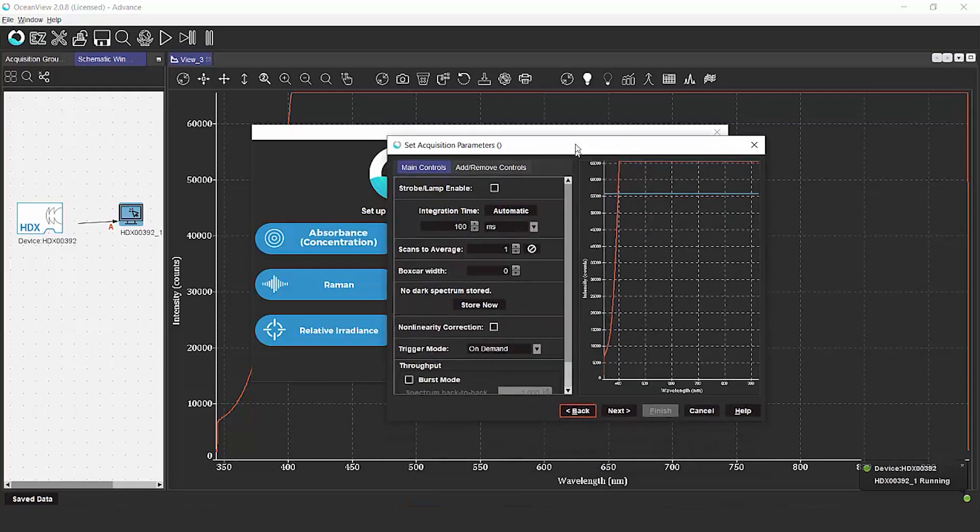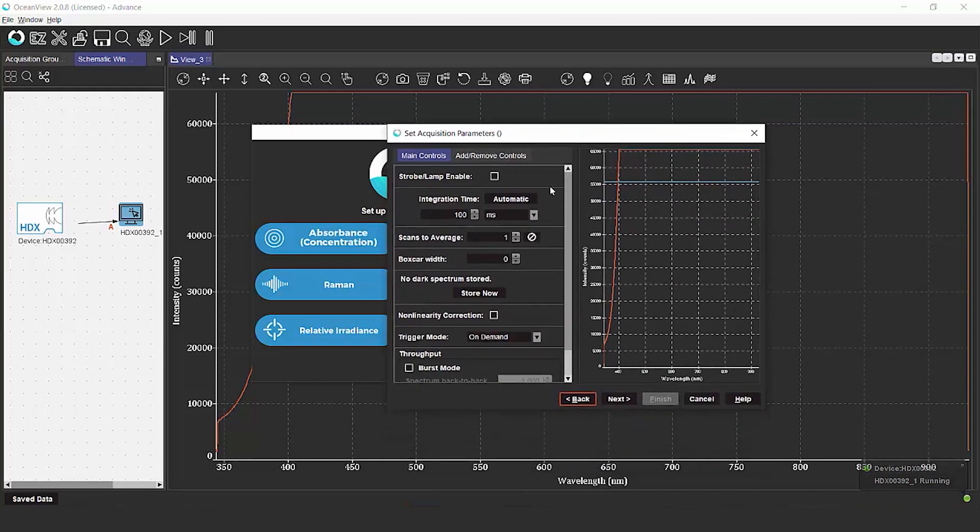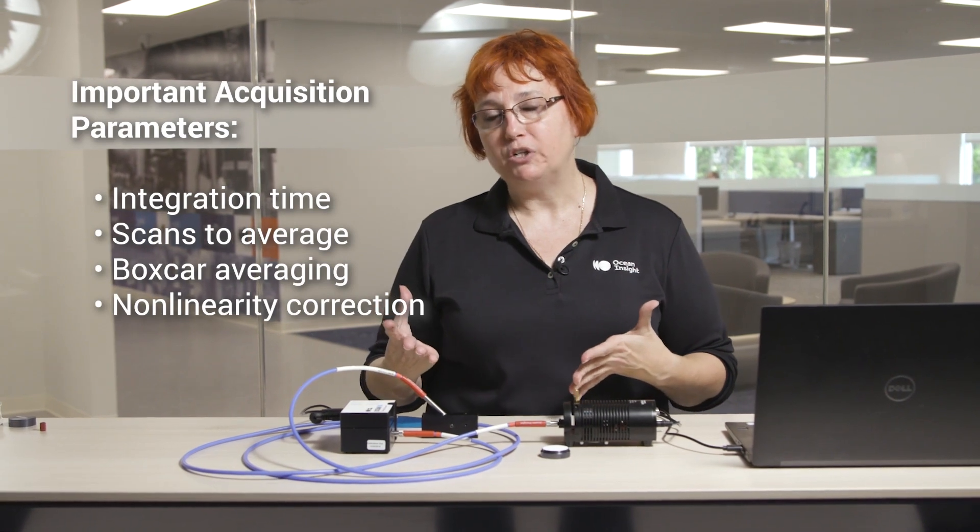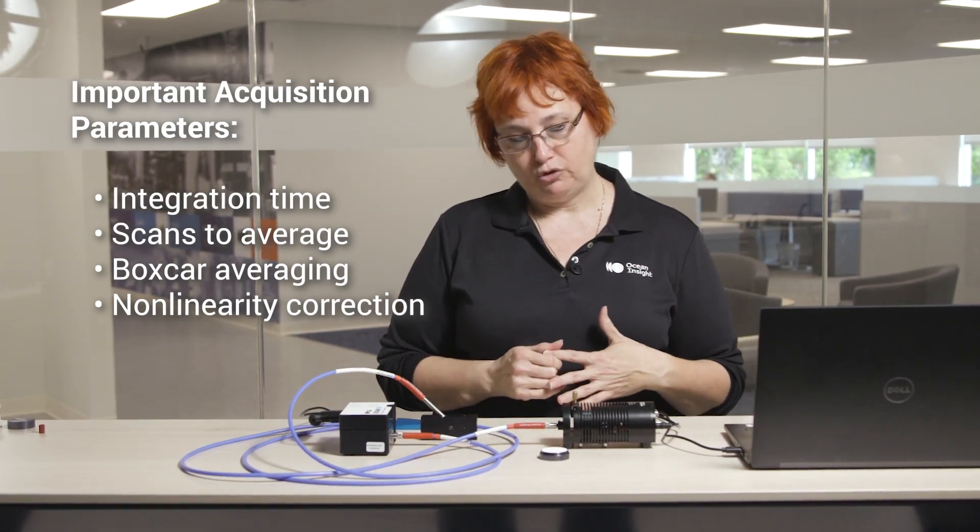Next we're going to set our acquisition parameters, and these are going to be the parameters that are used to determine how much light gets into the spectrometer, and even to help improve our signal-to-noise ratio.